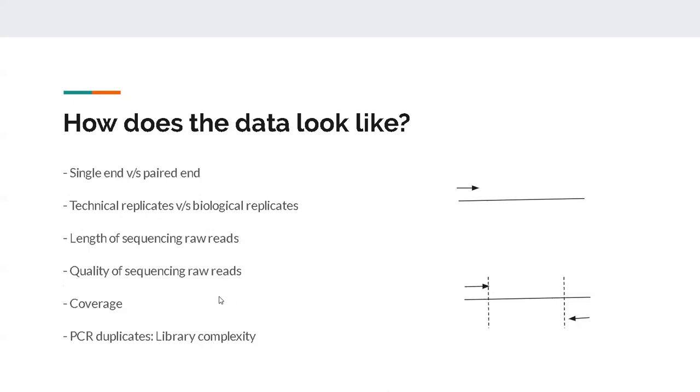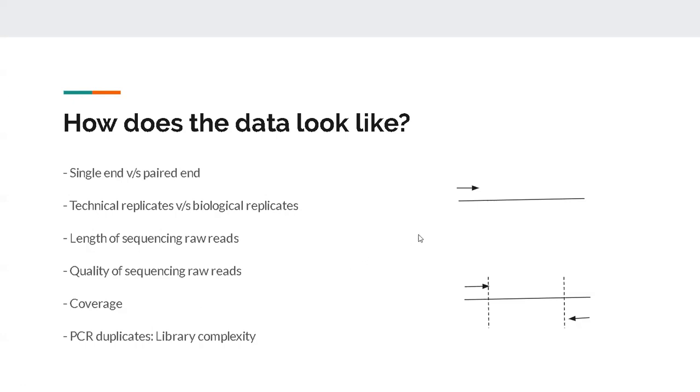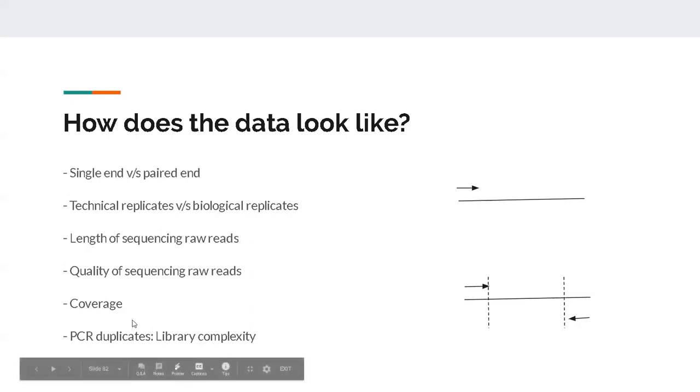You might not want to move ahead with the analysis if the quality of the reads coming out of the sequencer is very low, because this might end up giving you false results. These are anyway software, so they will produce some sort of result, but it is up to you to decide if the results make sense or not. We will test quality extensively in the next class, where I think Nitish is also going to discuss the theory behind it.